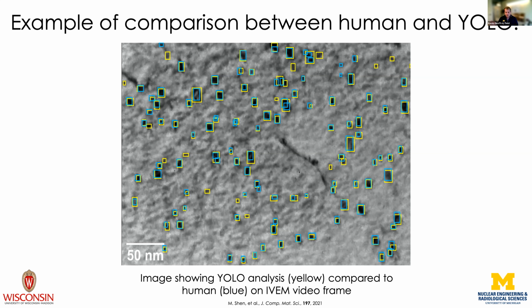And if I send out, just in the same game of playing cats, we did this with images, sent it out to a bunch of microscopists. If I send images out to microscopists and ask them to label the data, they get an F1 score, which is basically a mean between the number of defects and the accuracy of those defects. They get an F1 score of about 80%, humans do, right? So they're getting about a B minus. And if they're really good, they might get about a B or a B plus, right?